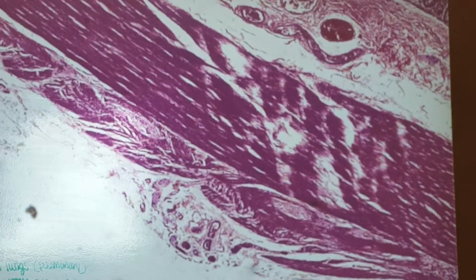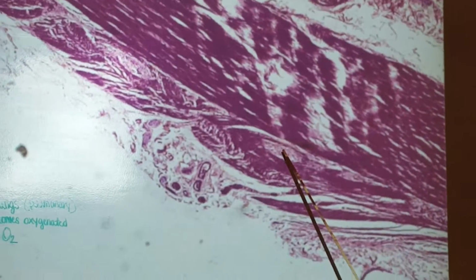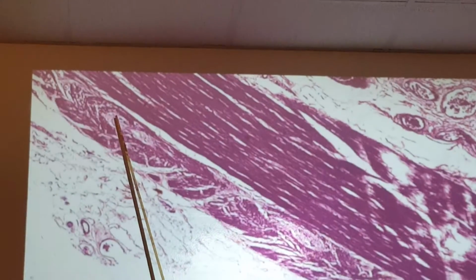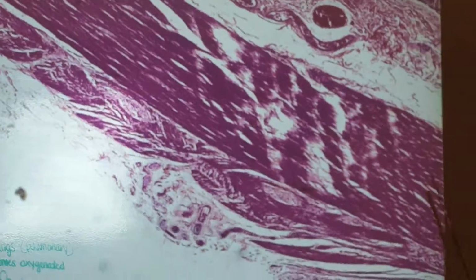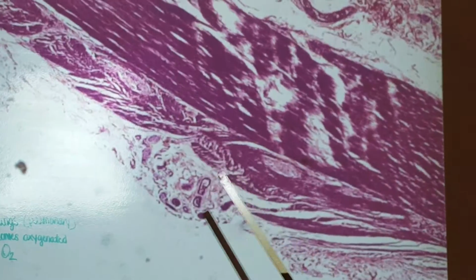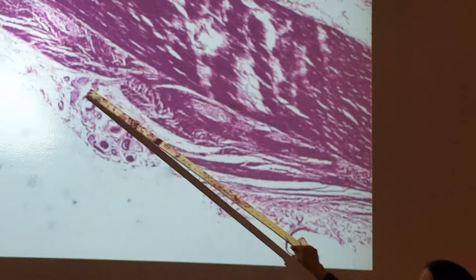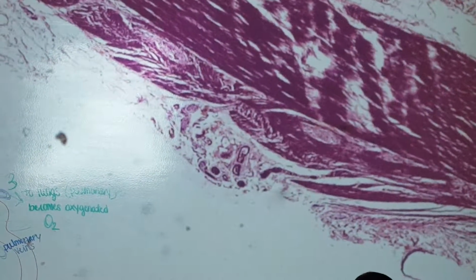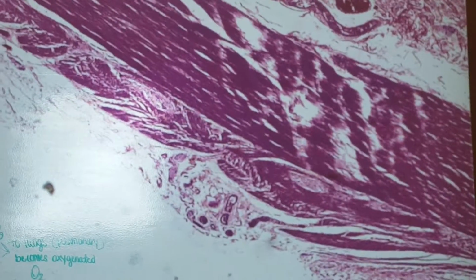Okay, so on here, that would be your ganglion. That would be another ganglion. Up there would be another ganglion. So above it would be our circular layer of the muscularis externa, and below it would be the longitudinal layer. And I really didn't point out the serosa on the other one, but again, it's just this outside layer. It can look very fibrous in a way on that outer lining.